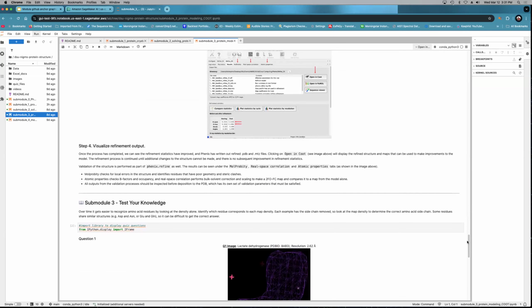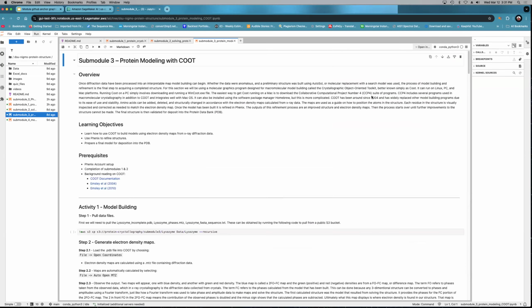So that's the end of the 3 modules that deal with protein crystallography, and it deals with the major programs, data collection, just a discussion of it. One thing that we don't talk about in these modules is the data collection process itself and scaling using a program like ScalePack. That's done either at the electron source, whether it be a synchrotron or a home source. Once you have scaled data, then the scaled data are used as the initial reflections used to solve the structure. And so we kind of take it from there.